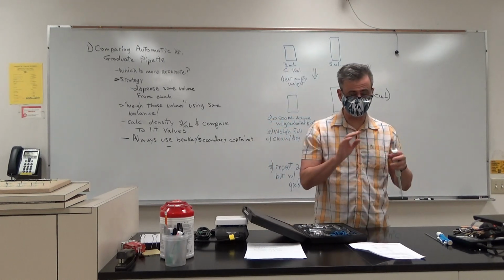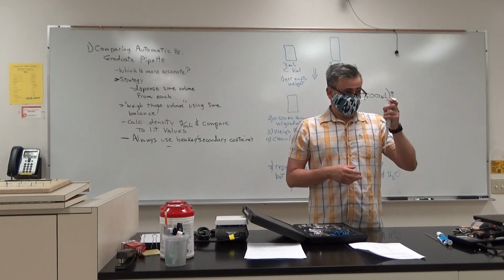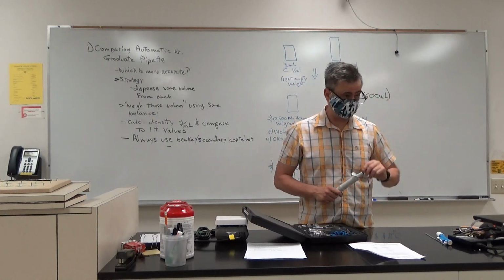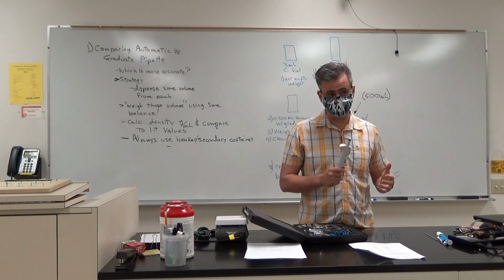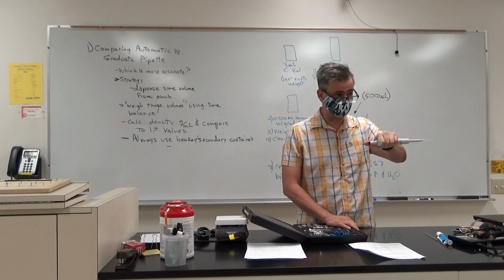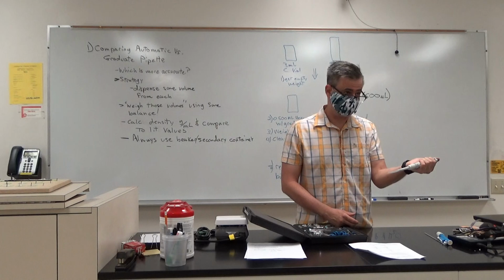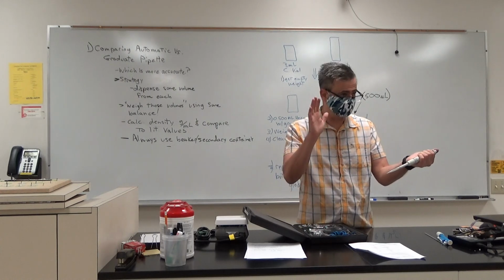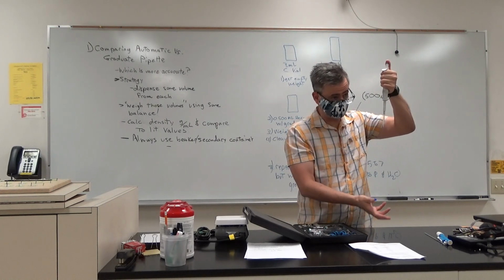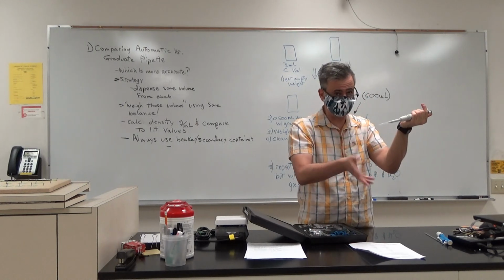One thing in general about all pipettes, and students always have trouble with this: with any kind of pipette, auto, graduated, or disposable, which we'll use a lot this semester, you always want to use them straight up and down, vertical, never horizontal. Students say, oh, I'm starting to dispense too much, I better tilt it. And that messes you up on so many levels. First of all, pipettes work better and stop things from dribbling out when they're vertical. When they're horizontal, they tend to leak more.